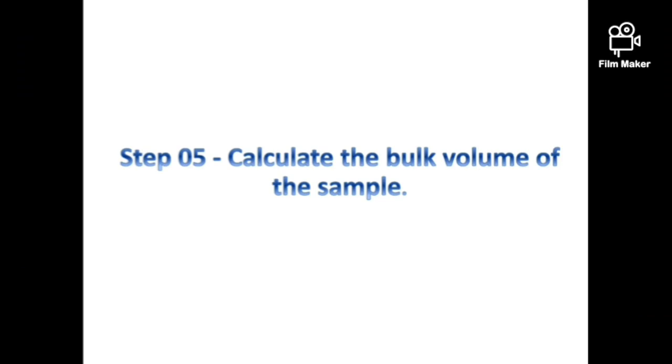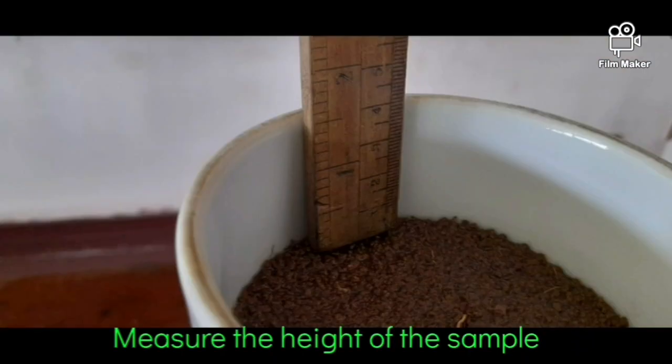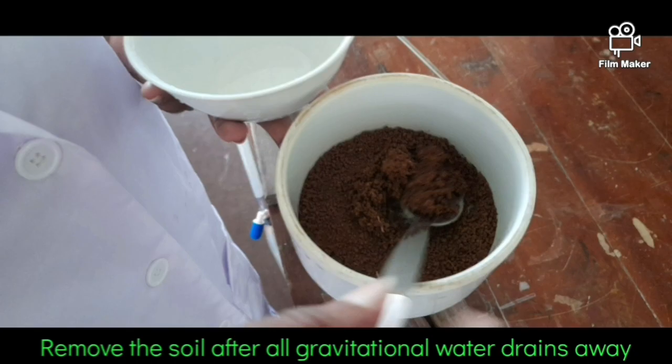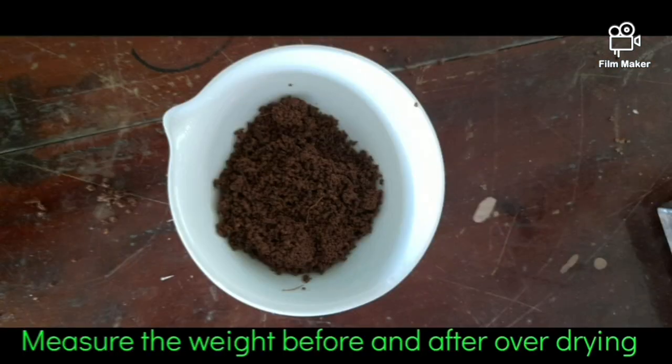Step 5. Calculate the bulk volume of the sample. Measure the inner diameter of the funnel and the height of the soil sample. The final step is calculating the oven dry weight of the sample. Remove the soil sample after all the gravitational water drains out. Then oven dry the sample and take the weight.